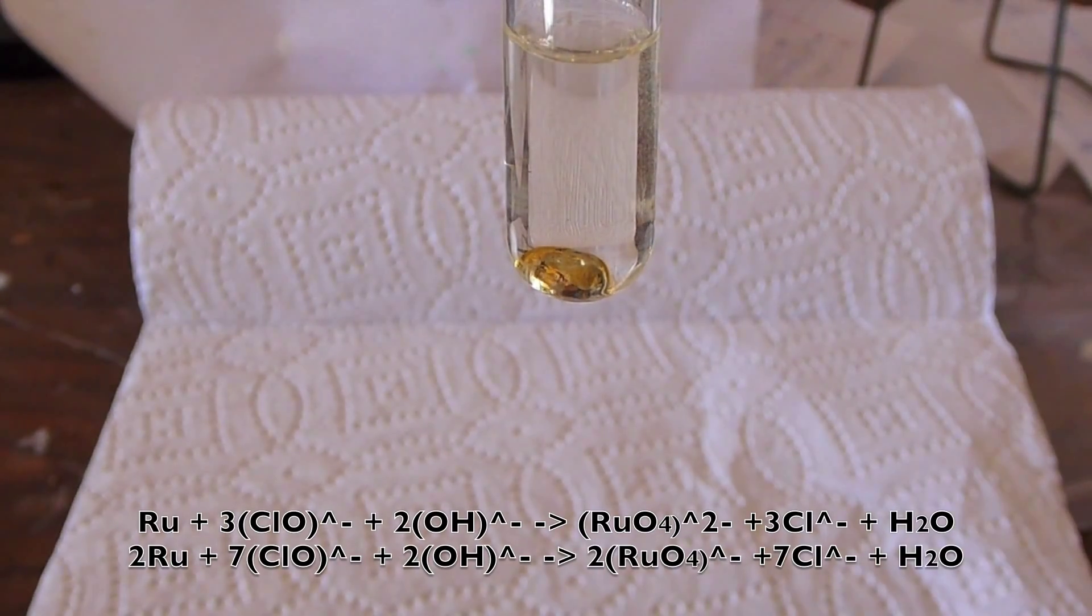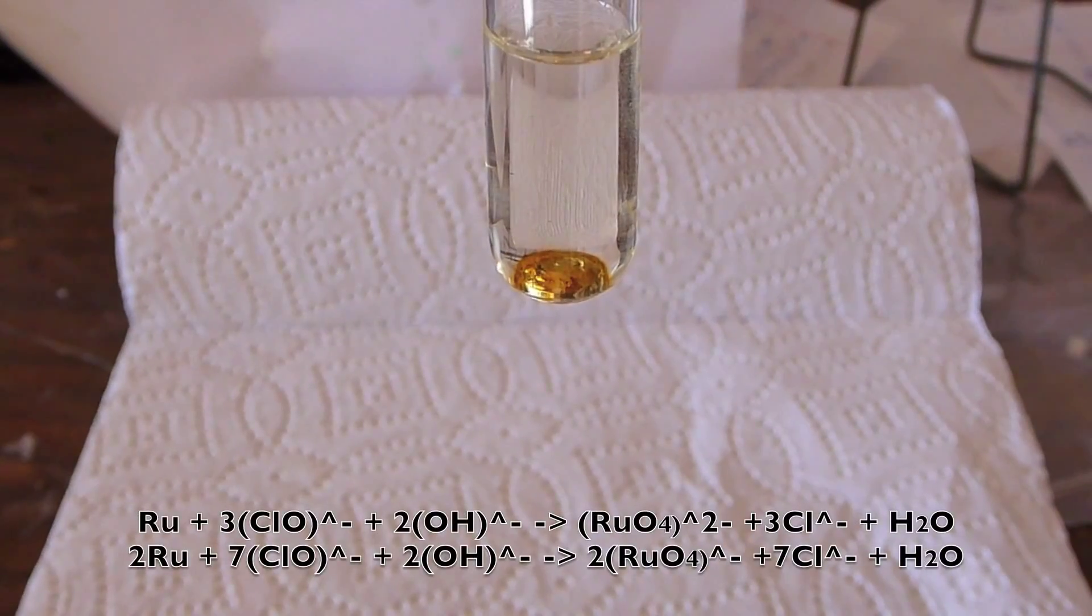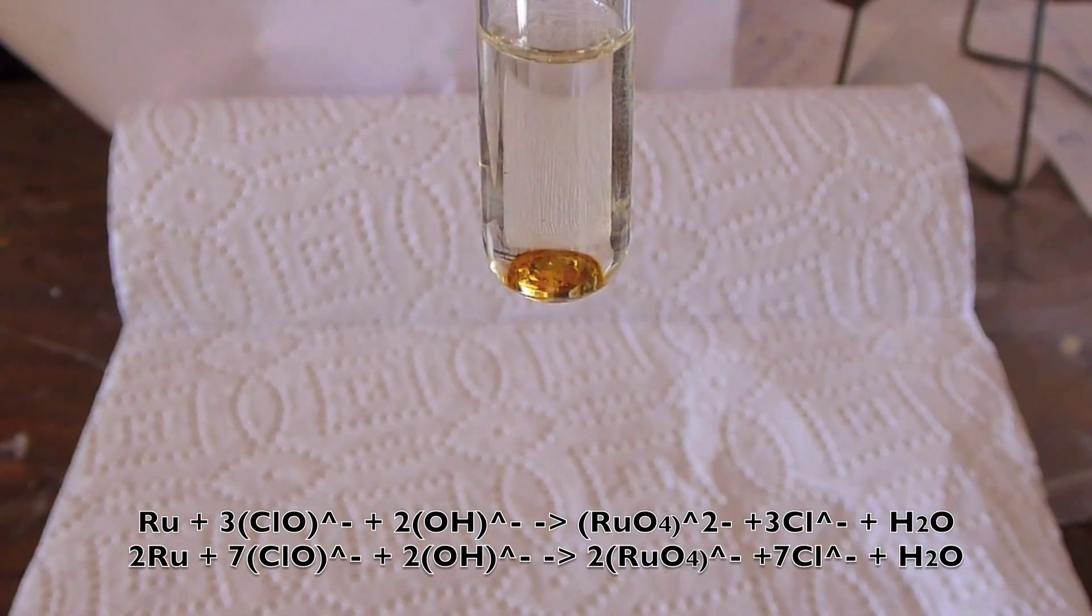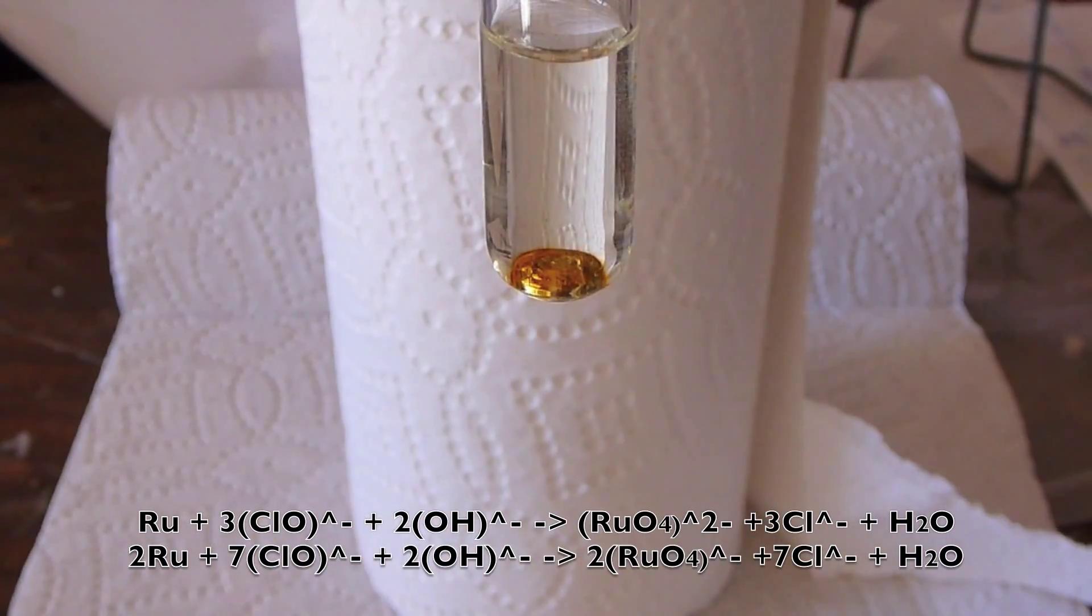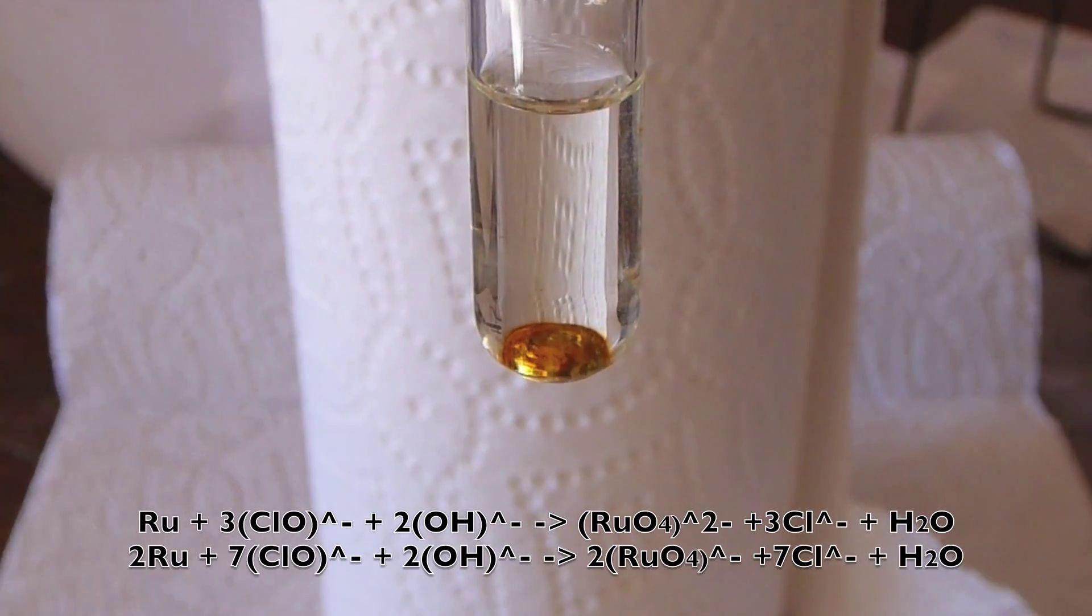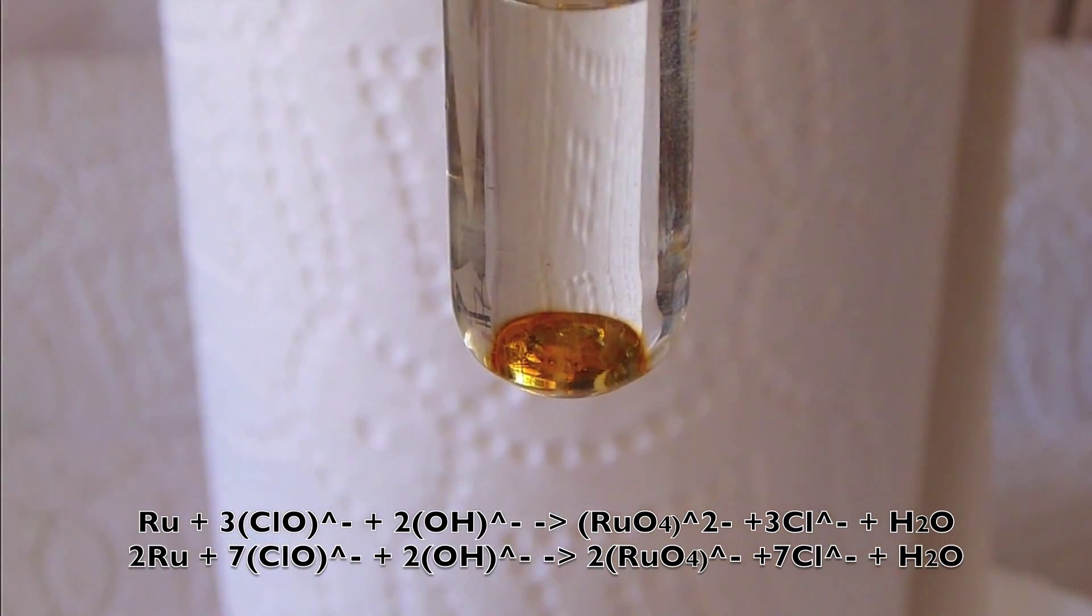The plus 6 oxidation state is in the form of the ruthenate ion. In the plus 7, the perruthenate. At room temperature, this reaction proceeds very slowly, so I'm going to start heating it up. But already, even without heating, you can see a little bit of a red around the ruthenium. That's a mixture of ruthenate and perruthenate.